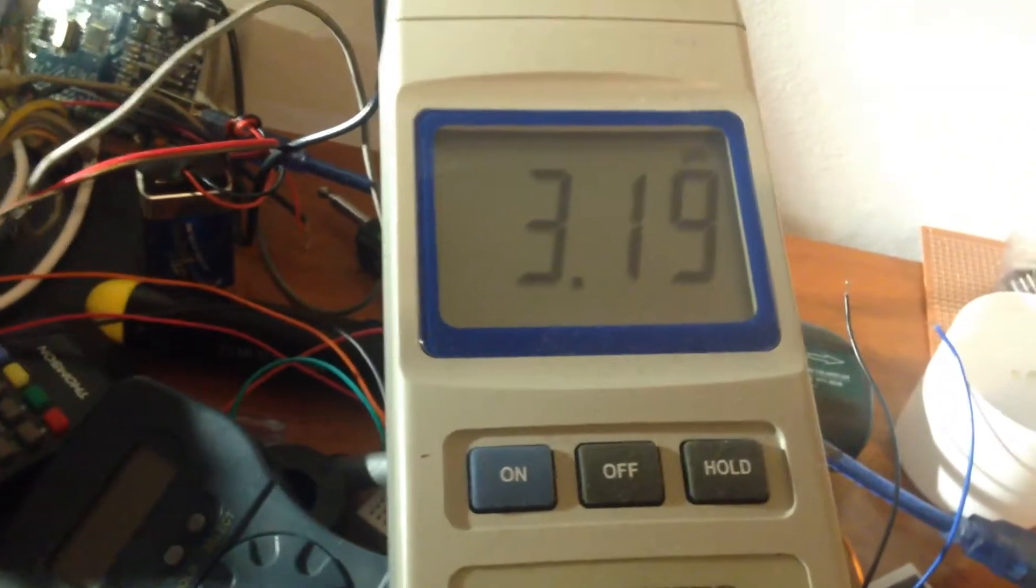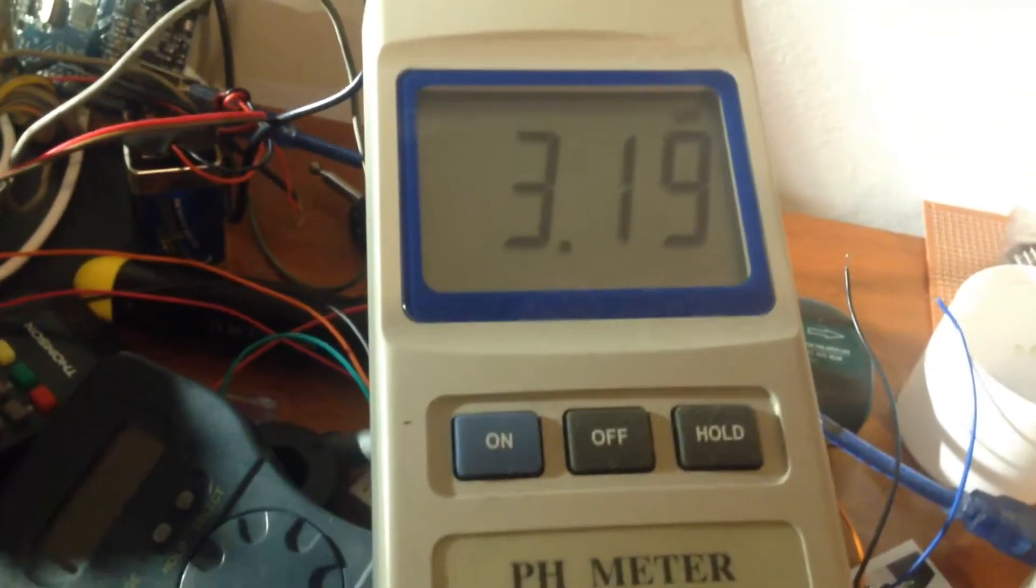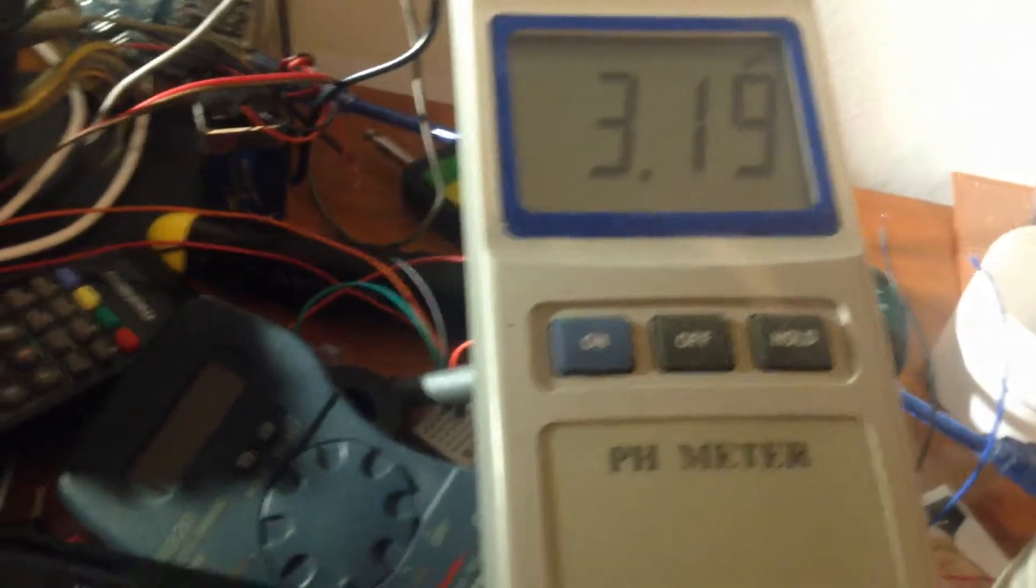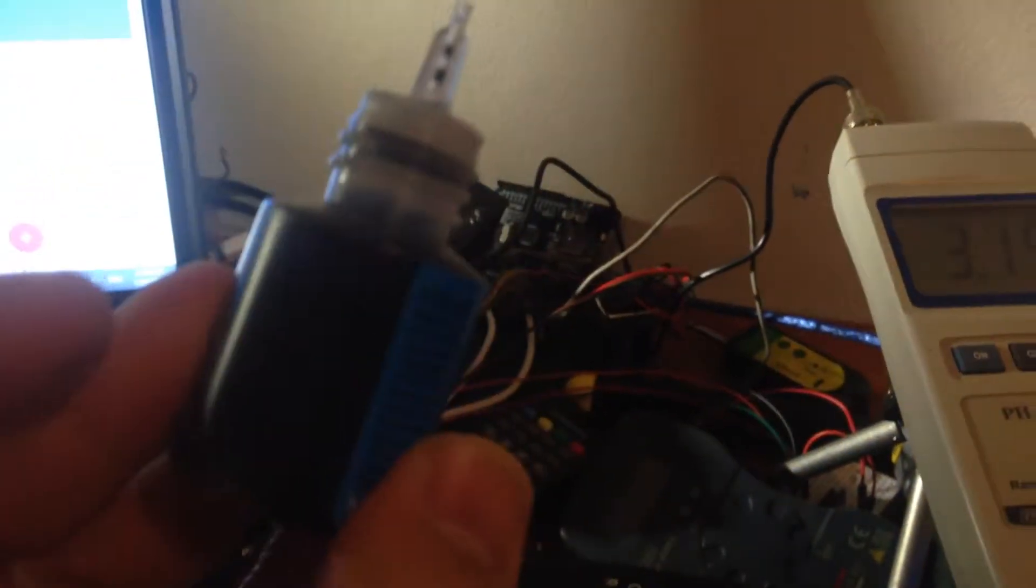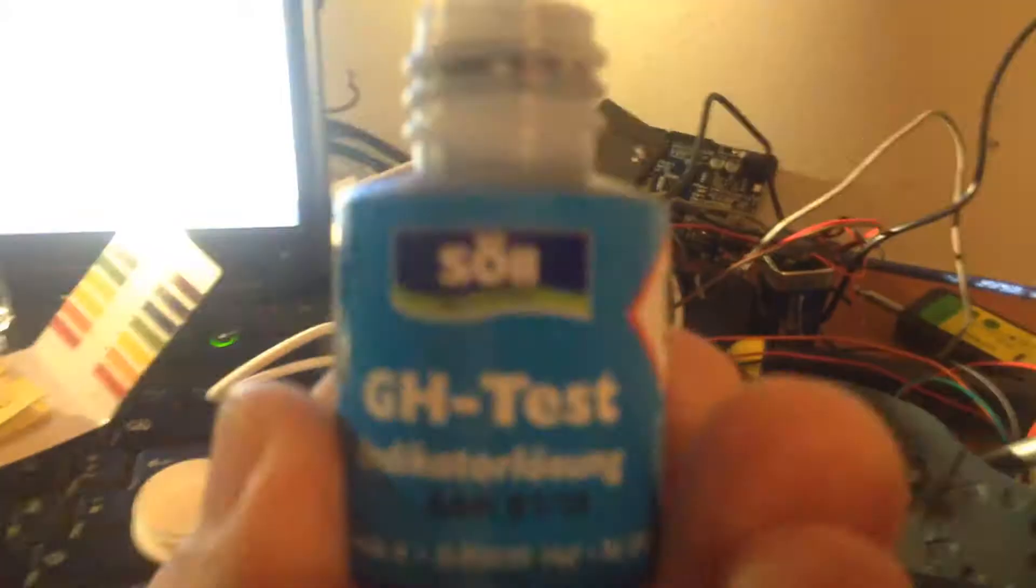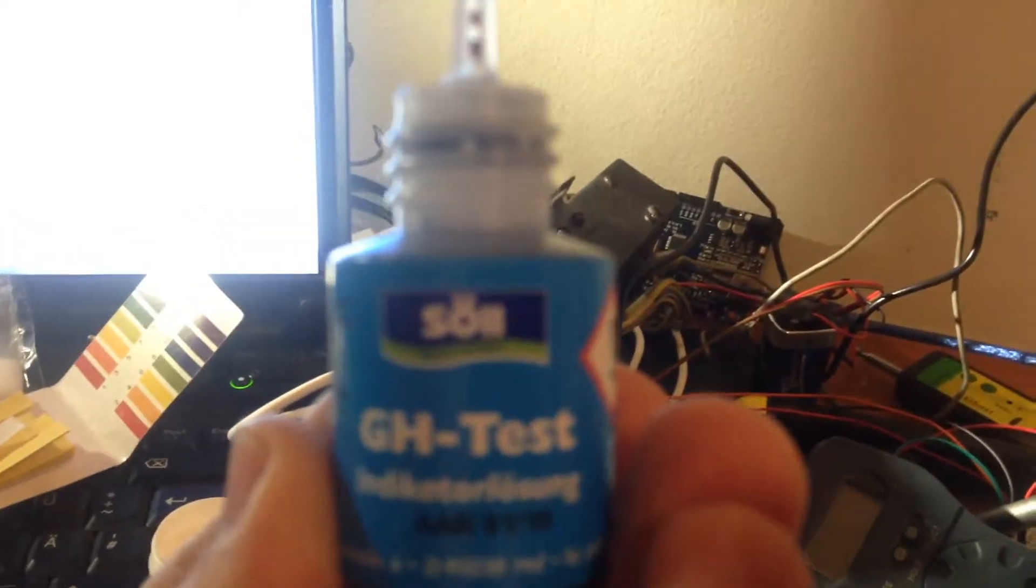You can see that the number of 2.6, it changed to 3.19. So we should know exactly that the GH tester will affect the liquid as soon as it's mixing with the original citric acid.